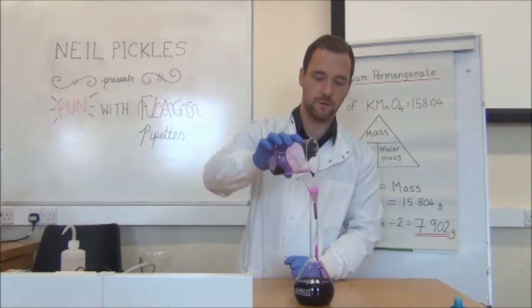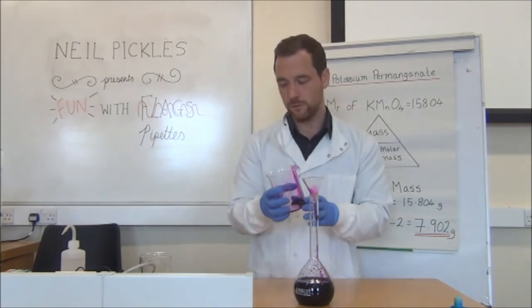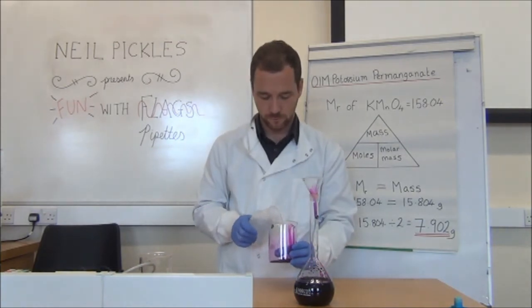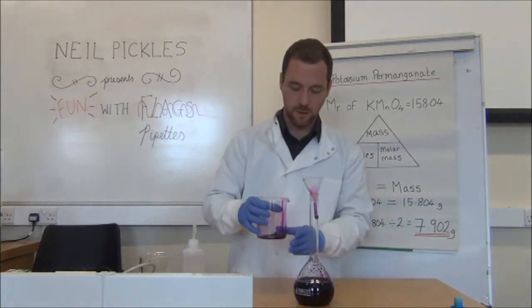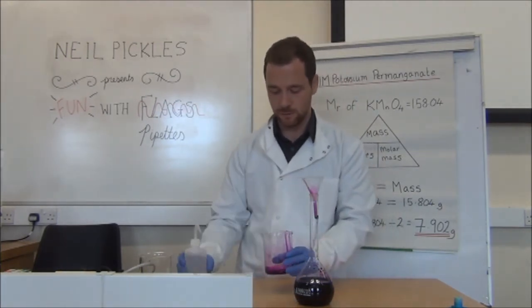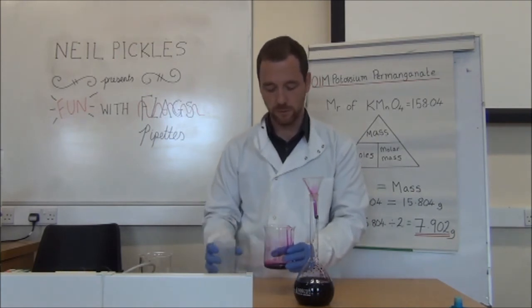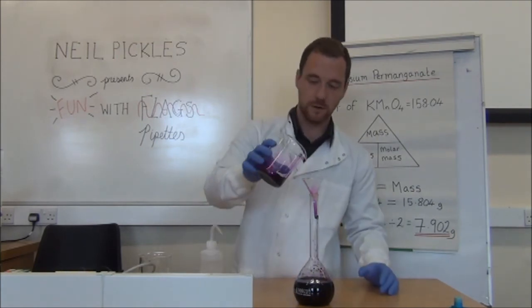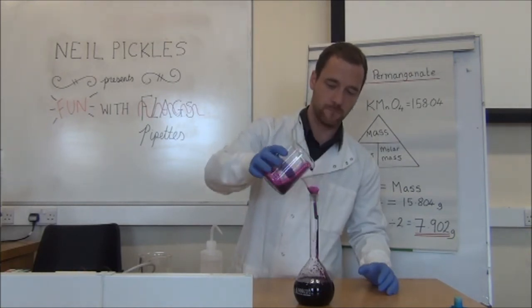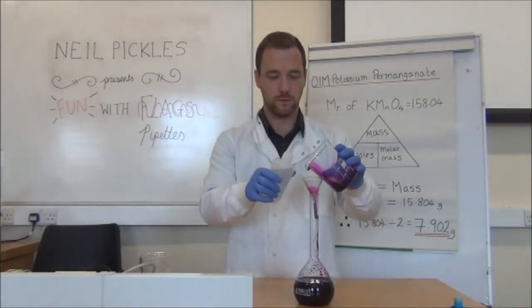And then the other stage at this point is to make sure that we wash the beaker out. And of course with this demonstration we know if that's occurred, because there should be no purple solution left in the beaker. And so it may take a series of washes.